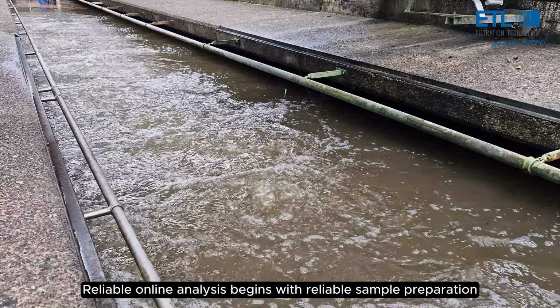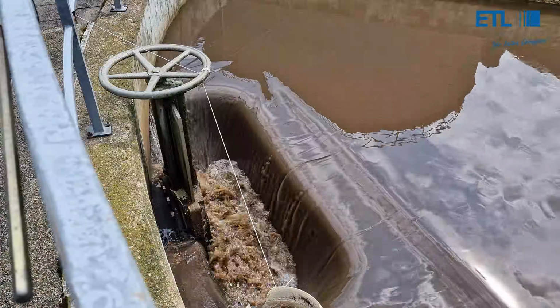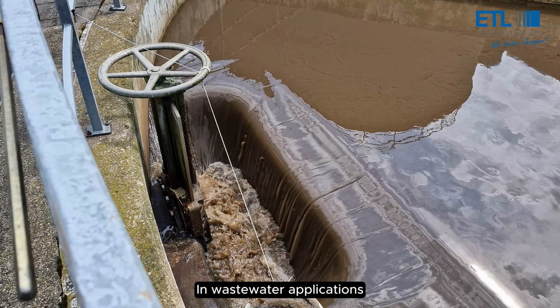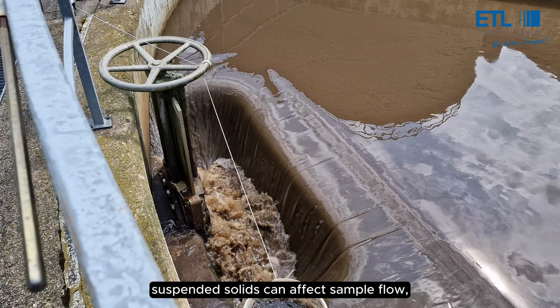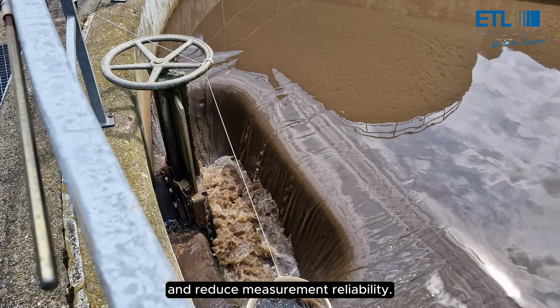Reliable online analysis begins with reliable sample preparation. In wastewater applications, suspended solids can affect sample flow, increase maintenance requirements, and reduce measurement reliability.